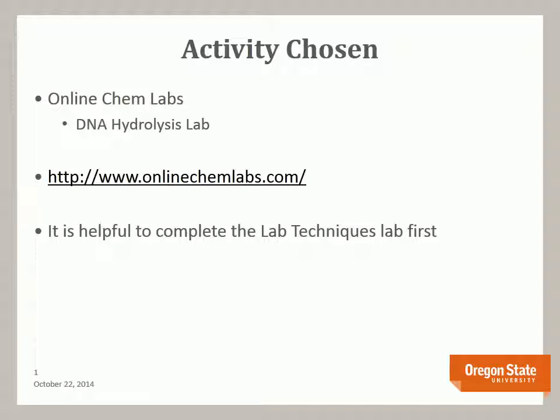This lab gave an overview of how all the labs are set up with intro material, then the lab activity itself with follow-up questions at the end. It also introduces you to the lab interface and the different tools that are going to be used and how those tools are used electronically as opposed to in real life.